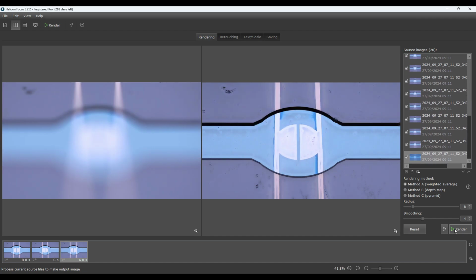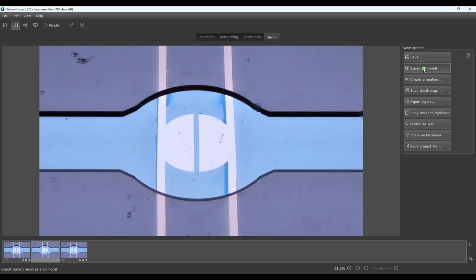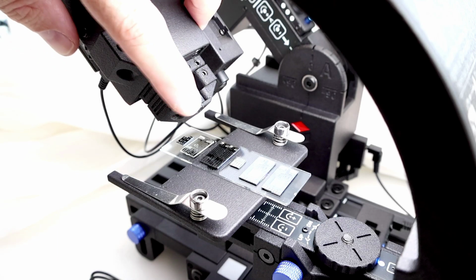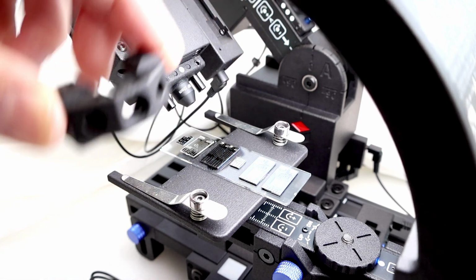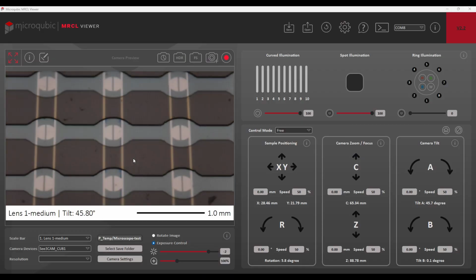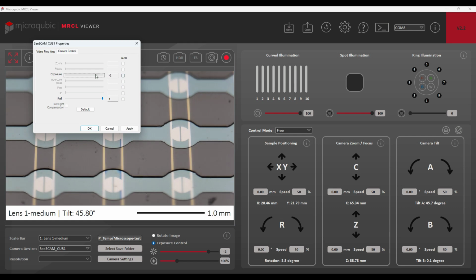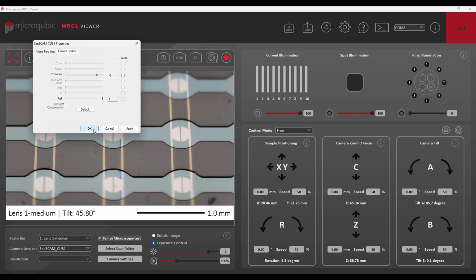You can even utilize its 3D modeling feature, which works best when the Z-stacking is done directly from the top of the sample, without any tilting. When focus stacking is not an option, such as during live measurements or video recordings, please use the provided iris diaphragm for aperture control. Similar to any other microscope or photography system, a smaller aperture results in a larger depth of field. However, you may need to increase the illumination intensity or exposure, as images may appear darker or noisier with smaller apertures.